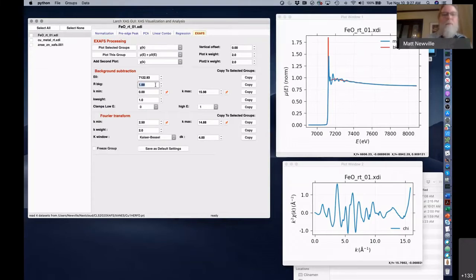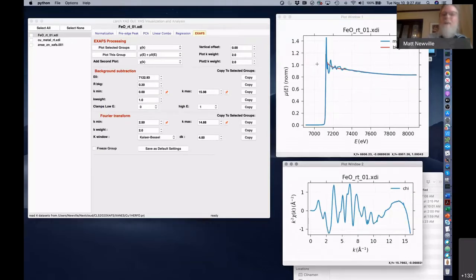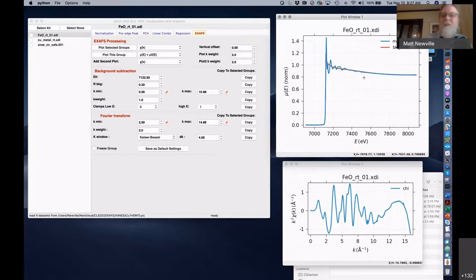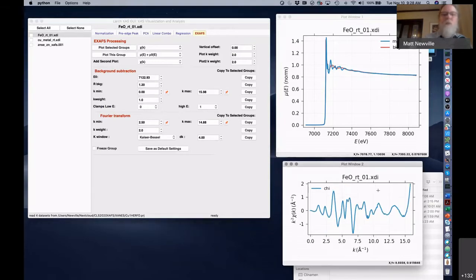and consider them to be background. If I make that very small, let's say 0.2, then the background function is very stiff, and you can see the background subtraction still has some low frequency oscillations to it. If I make it larger, in fact, I'll increase that to 1.2, it does a better job, and maybe that's better, and maybe it's worse.